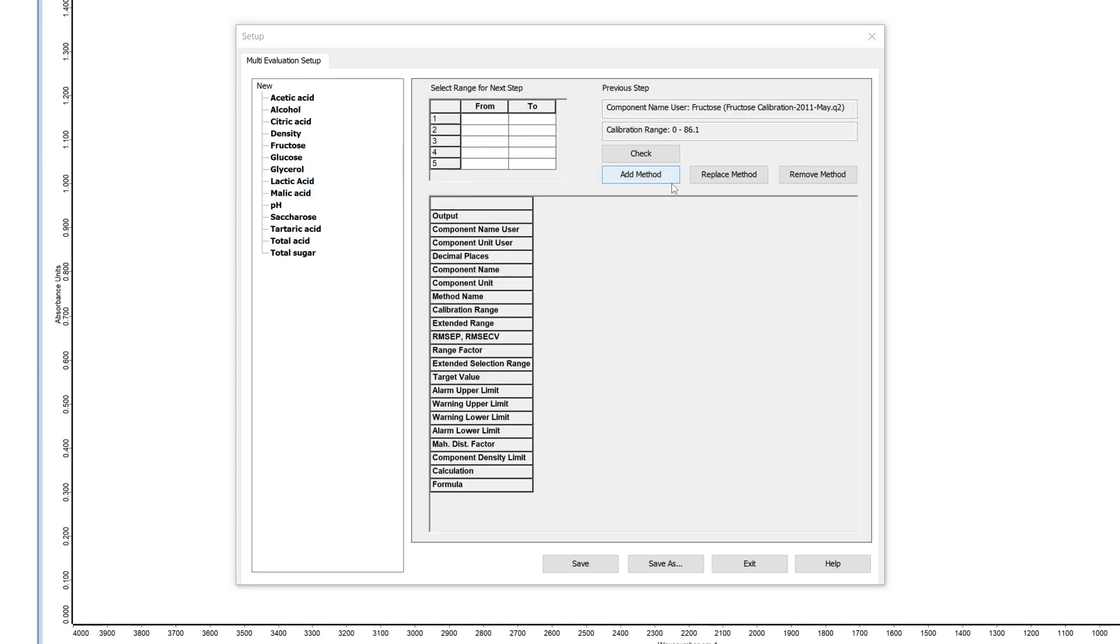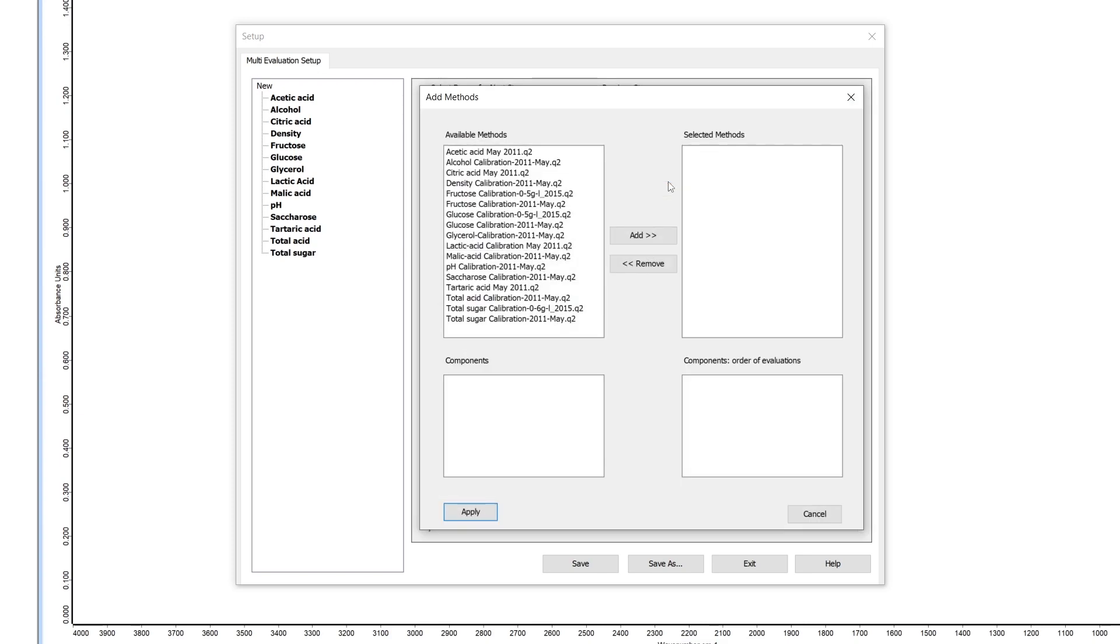Select your method with the concentration range within the range of your first method via the add method button.